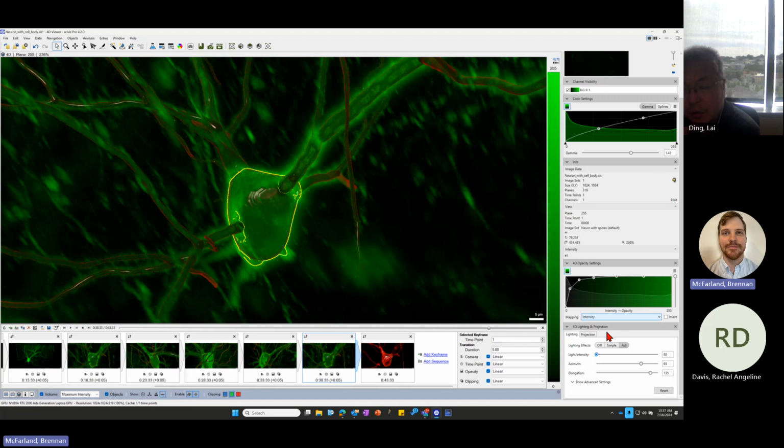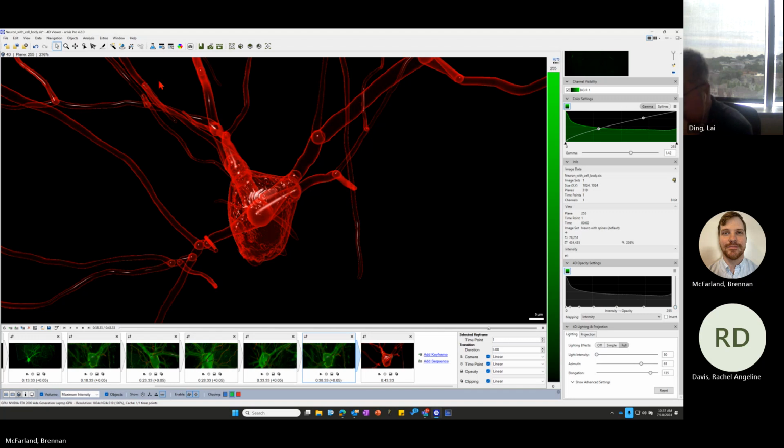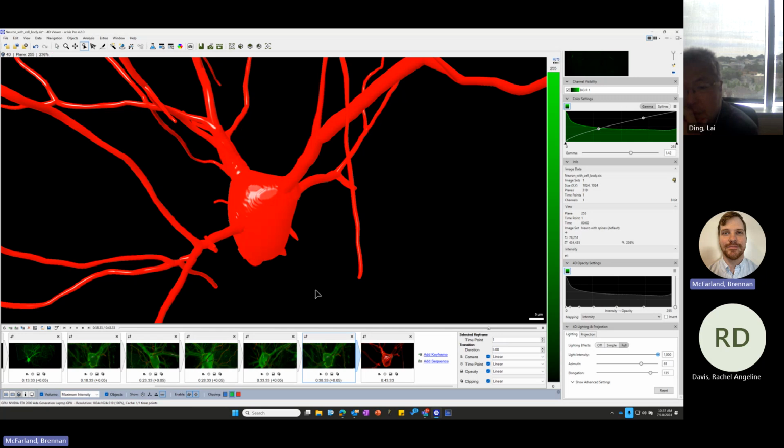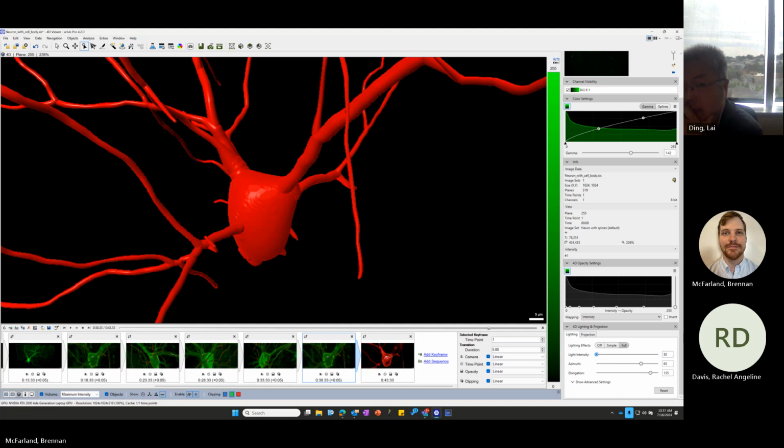and this would also work for, let me turn down this. Here. I'll turn this to be 8. So now you can see that it's also going to adjust the lighting, if you will, on the objects themselves, in addition to the volume. Also the direction of where that light's coming from. So the azimuth direction.